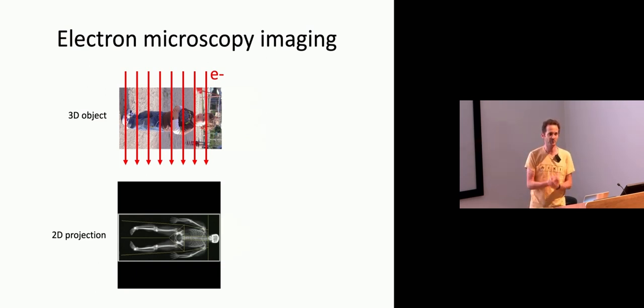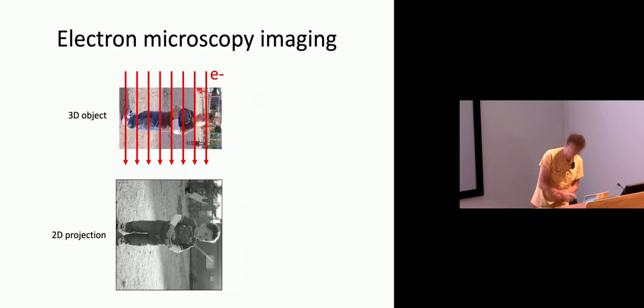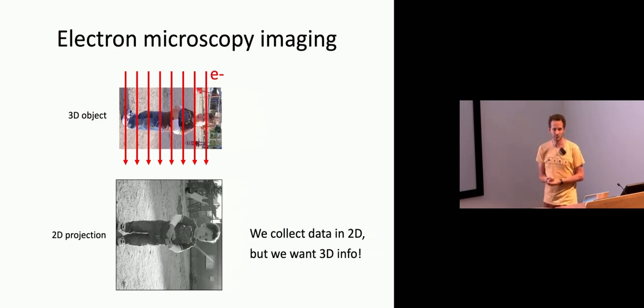These are called X-ray integrals in mathematics even. So that's a very ugly picture. So I will use a black and white version to denote a two-dimensional projection image of the three-dimensional object that is Jan, which will be depicted in color. So that's the first problem that we have if we want to process the 2D images from the Cryo-EM and get an estimate of the 3D structures of Jan that we're interested in, that the data is actually recorded in 2D.